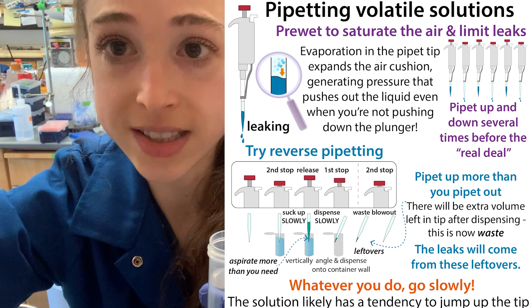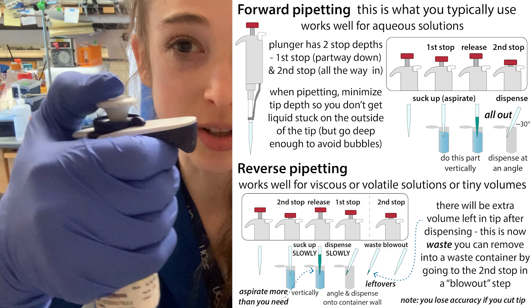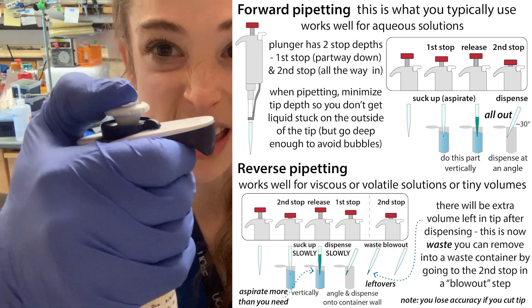If you are really in a hurry, another option is reverse pipetting. A pipette has a couple of different stops — there's a first stop and then there's a second stop.